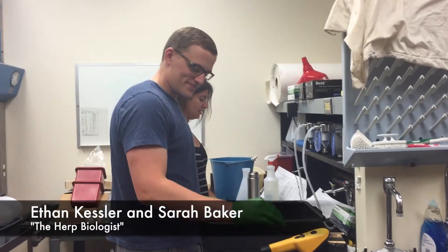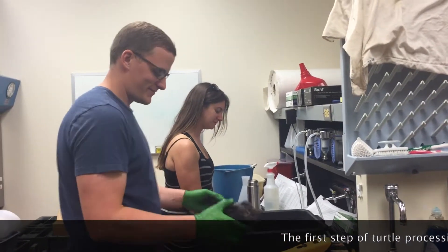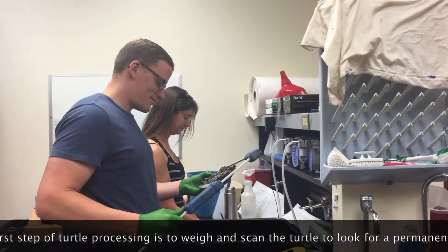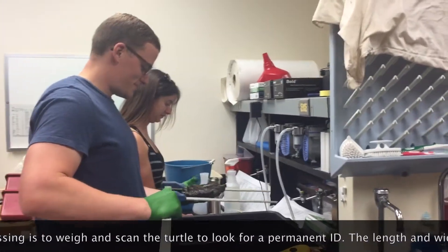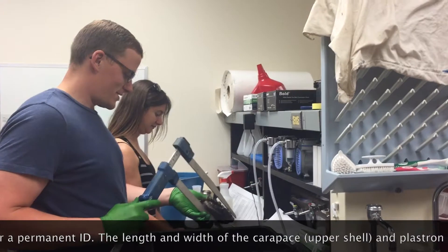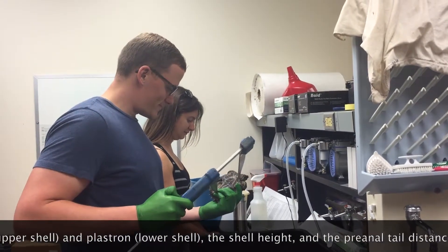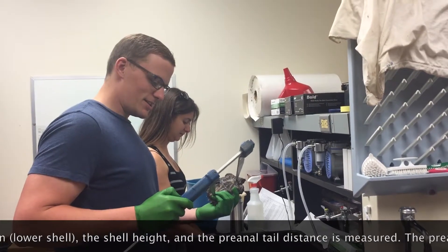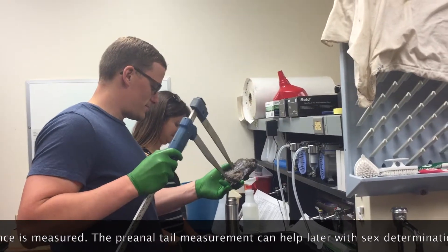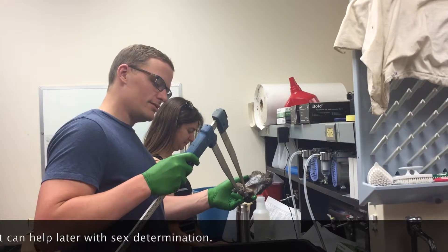Got that Sarah? Yes sir. Mass is 406. Carapace length 132. Width 109. Shell height 56. Plastron length 99. Plastron 29. Preanal tail 29.